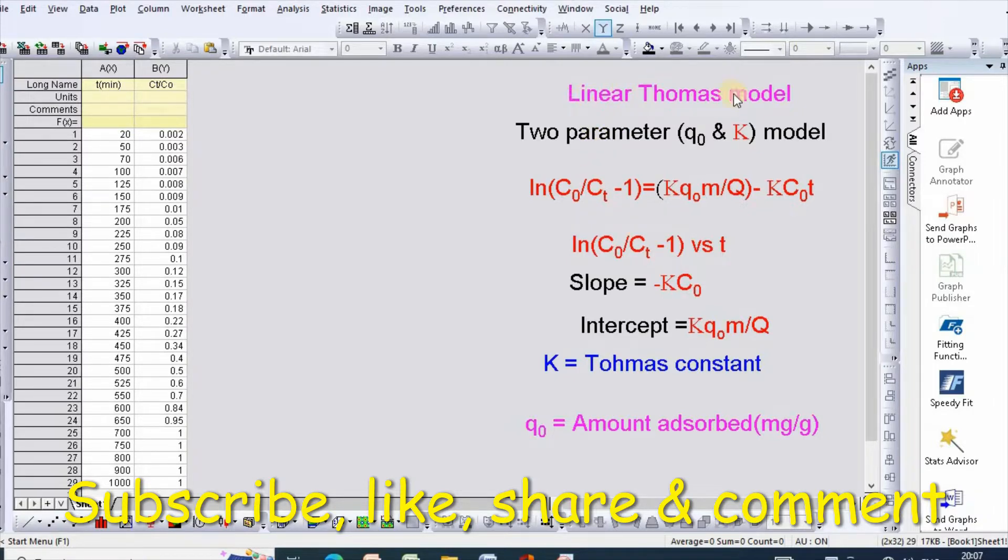Linear Thomas model is a two-parameter column adsorption kinetics model, and the equation can be written as ln(C0/Ct - 1) = (k·q0·m)/Q - k·C0·t.